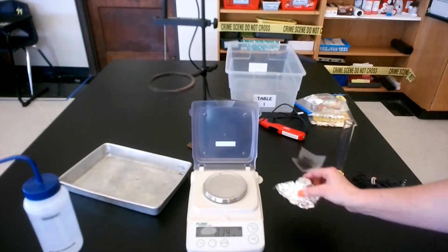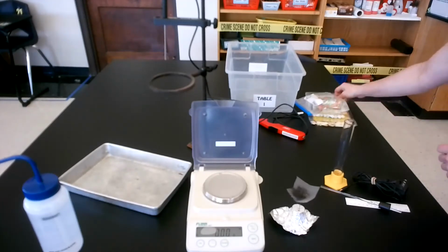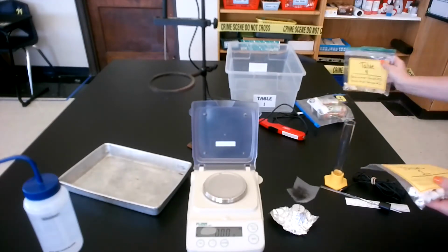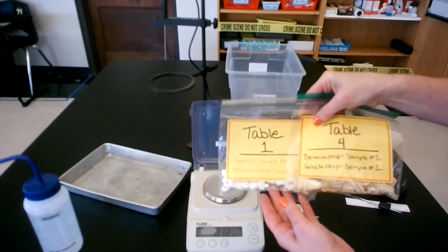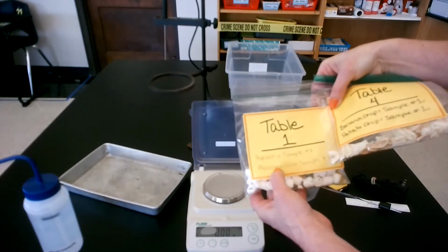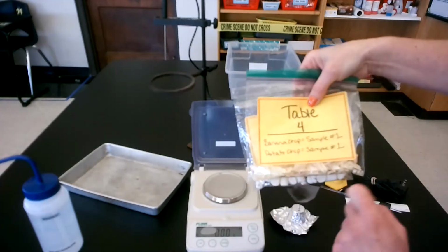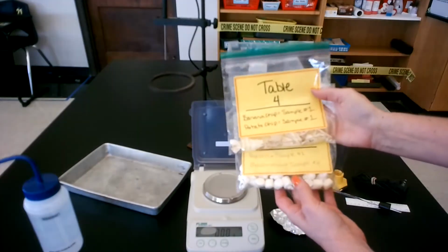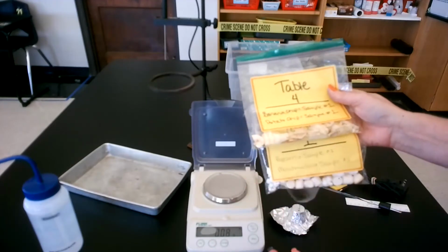So I've got my food holder. Now I need to determine the mass of the food holder and the food, because eventually I just want to know the mass of the food. Depending on what table you're at, you're going to have bags, and each bag is going to have two food samples in it. So I just grabbed one. Tables 1 through 3 are going to be testing popcorn and marshmallow. Tables 4, 5, and 6 will be testing banana chip and potato chip. And then each bag, this one just happens to be sample 1, but you could have table 5, sample 2.